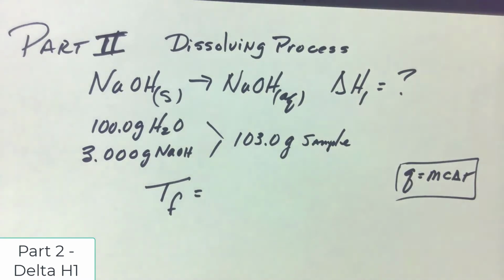Now sodium hydroxide is very caustic. If you get it on your skin, it will destroy your skin. It's also deliquescent, so if I left the container open, it would absorb moisture from the atmosphere and create its own solution. So when you're using sodium hydroxide, I do suggest you wear gloves, unless you're really careful, and just remember to put the lid back on when you're done getting the sample.